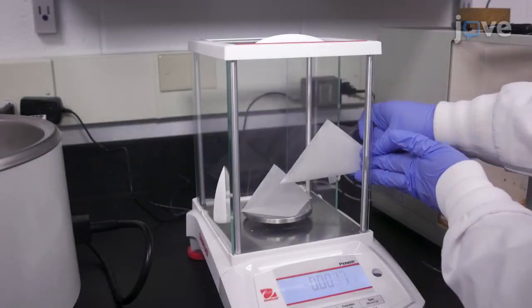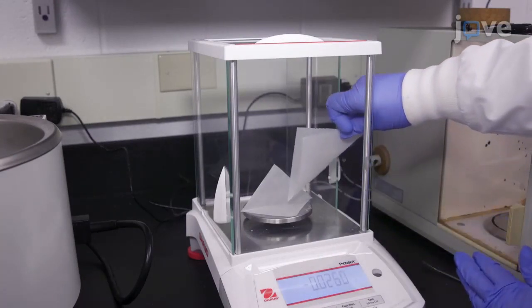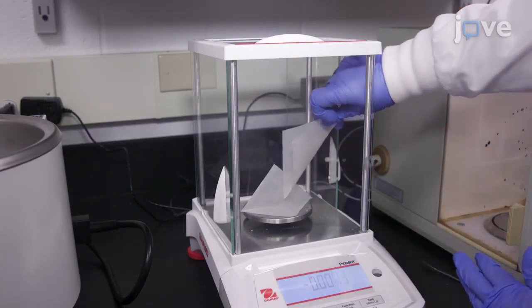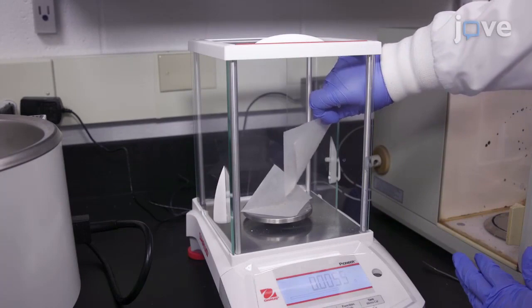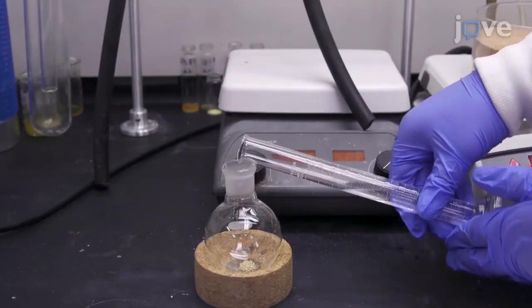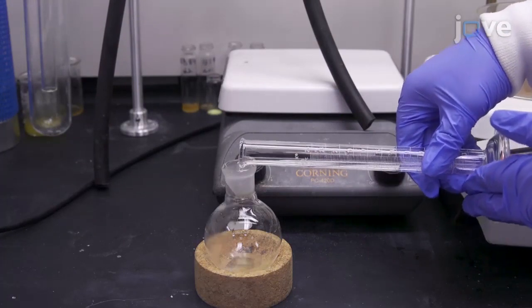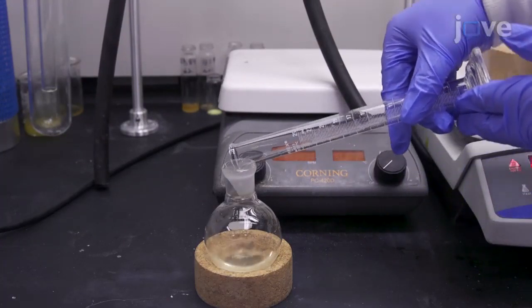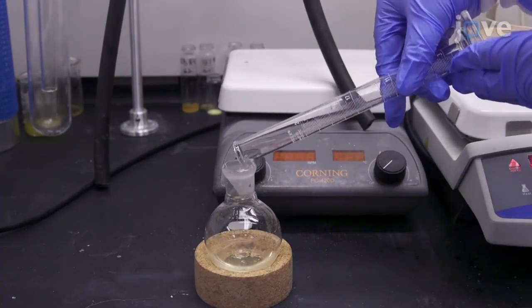To prepare complex 4, add 0.121 grams of 2,6-bis-N-isopropyl-N'-methylene-imidazole-2-thione-pyridine and 0.0851 grams of cobalt(II) chloride hexahydrate to a 100 milliliter round bottom flask containing 15 milliliters of acetonitrile.